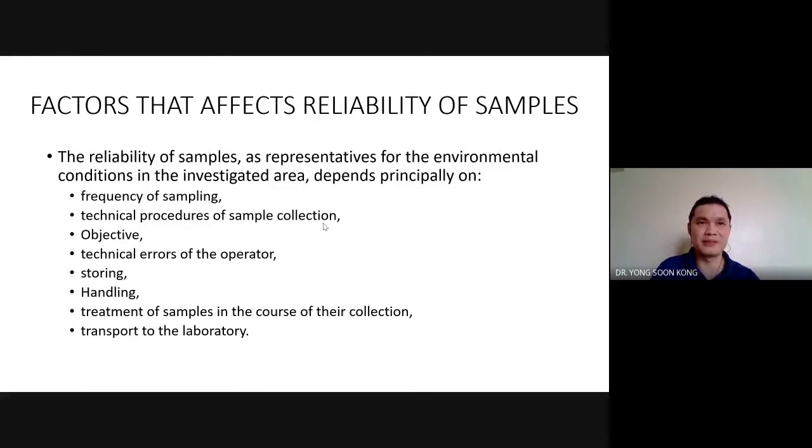Say, for example, I take CEC. Now, in CEC, you know there are two methods, guys. One is where you determine base saturation. So you leach out and determine all the cations and calculate the CEC one by one. The other one is the sodium acetate method, the one that you did in experiment 9. Both of these are accepted methods.